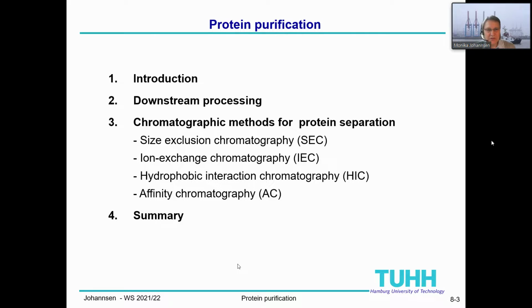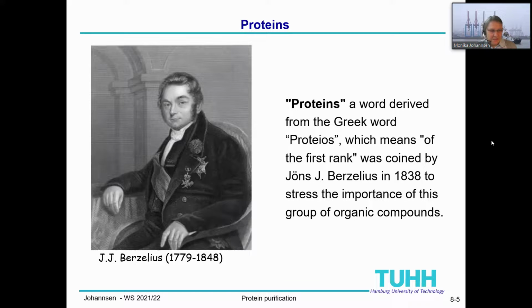I will give a short introduction into protein purification and into downstream processing, which has more steps than just the separation steps. And then I would like to focus on the chromatographic methods for protein separation, and I will conclude with a short summary today. So let's start with this slide.